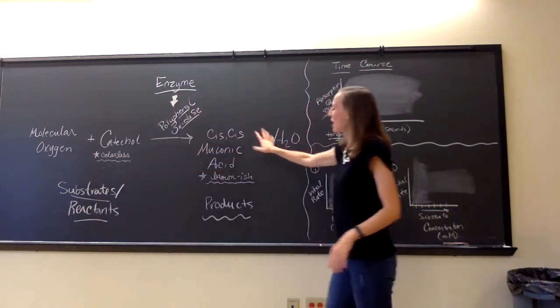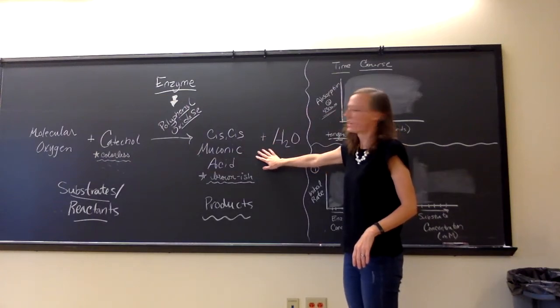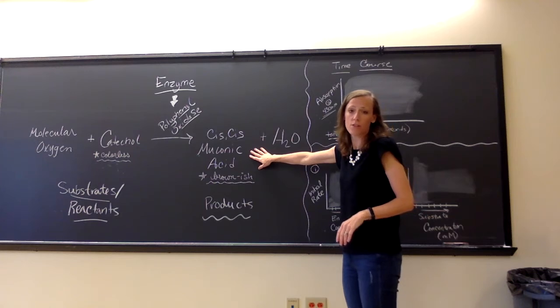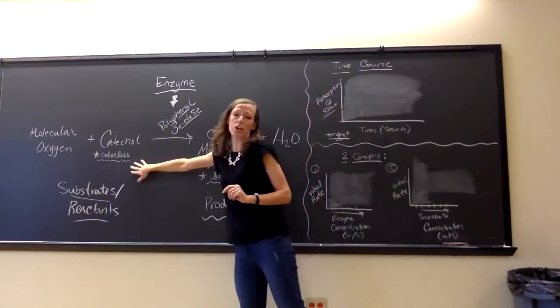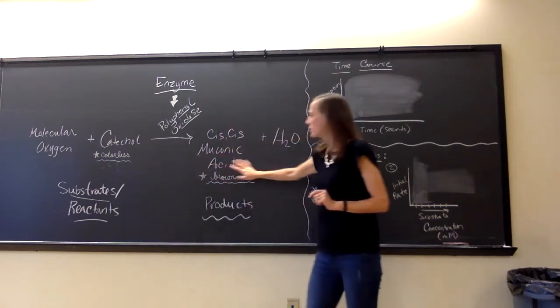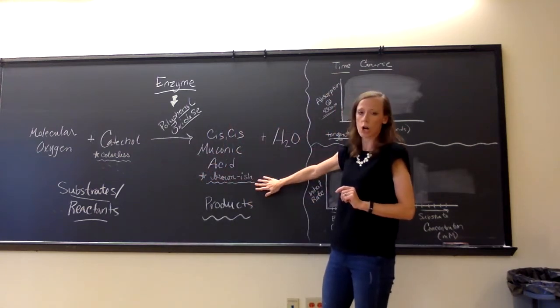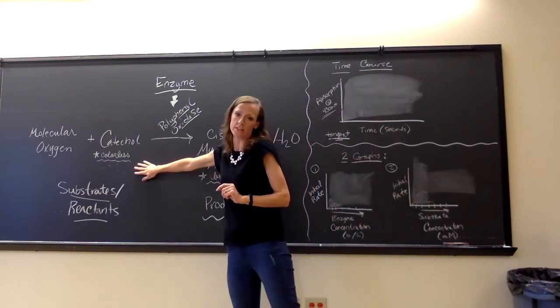And so as this reaction takes place, the conversion to the product, cis-muconic acid, can be easily observed because of one helpful feature. There's a color change from catechol to cis-muconic acid. Cis-muconic acid has a darker, much browner appearance to it than catechol does.